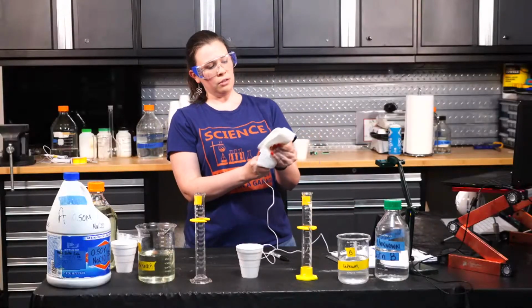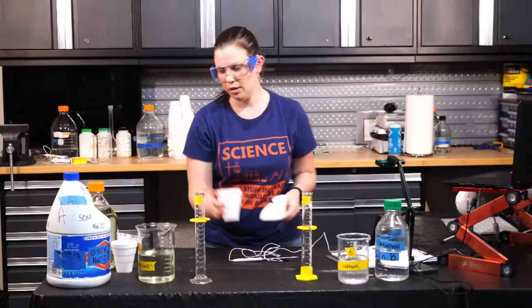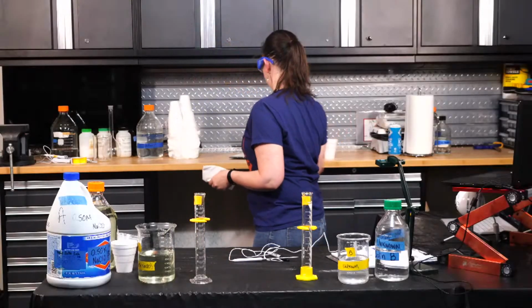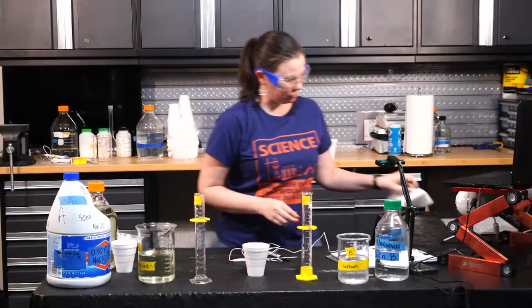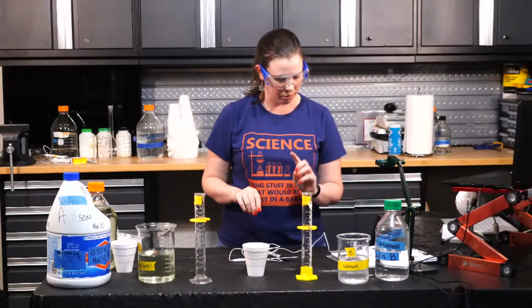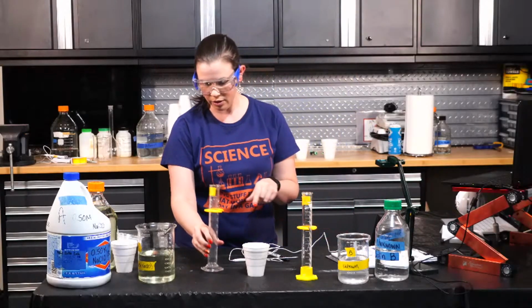Clean this guy off. Make sure we don't have any cross-contamination. I'm going to get a brand new cup. So we're going to mix level 4, where we have 35 milliliters of bleach.